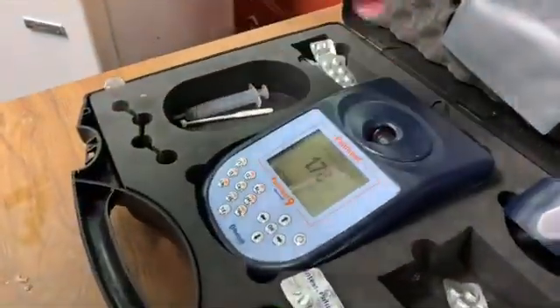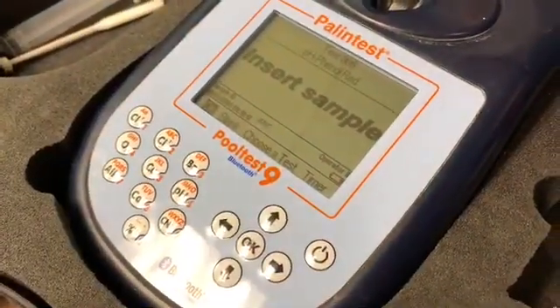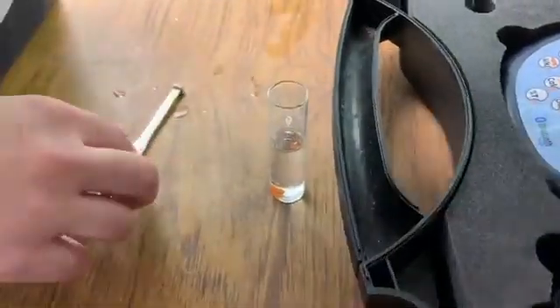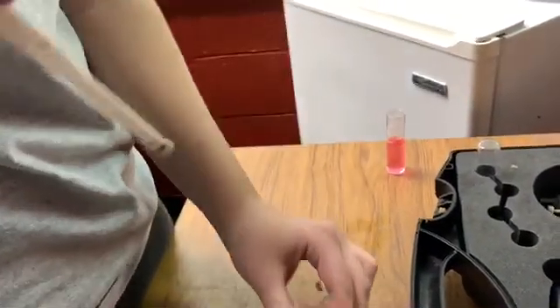You will then remove your sample and repeat this process for the Phenol Red to test pH. So now we have it already blanked. You will insert a tablet and crush it up.